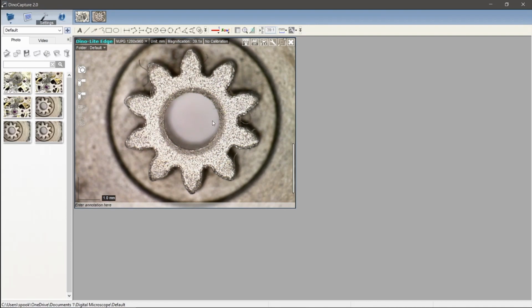The most popular of our circle measuring tools is the 3-point circle. Using this tool, I can select 3 different points along the edge of the circle, and it will automatically generate the circle for me. Similar to the 3-point circle, the next tool is the 3 points arc. Using this tool, I can select 3 different points along an arc, and it will calculate the arc for me.